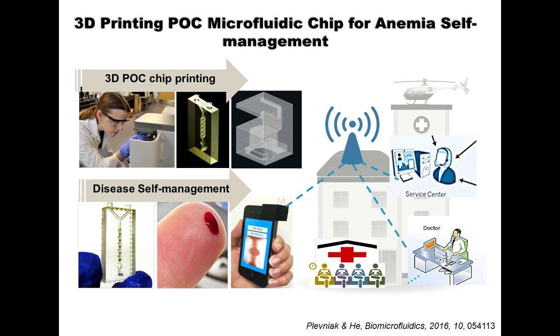The result can be recorded by the cell phone, analyzed, and sent to the hospital, and the hospital can connect with a doctor. That reduces visits to the hospital, which is especially useful for rural areas that don't have much access or transportation to clinical visits.